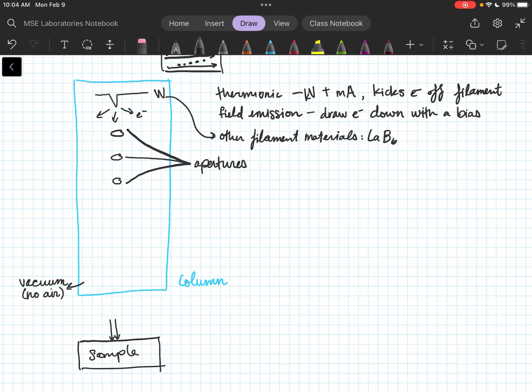I know more about its physical functions, not as much the effect. What they are doing is narrowing or opening the amount of light coming in, so an aperture is going to close off or open up. I have my field and you have your field. The effect is cool. I like learning that.